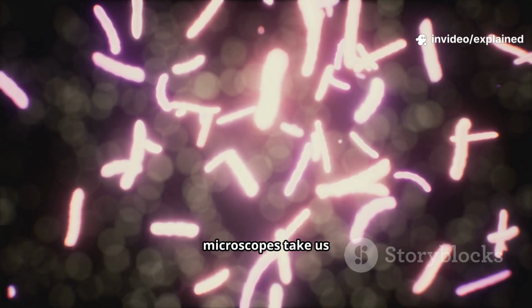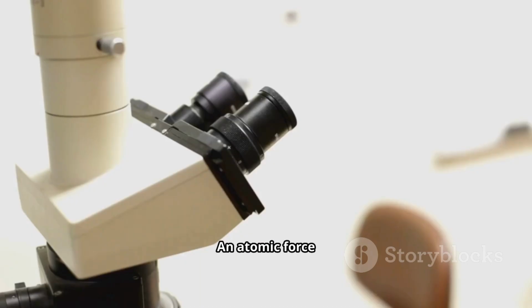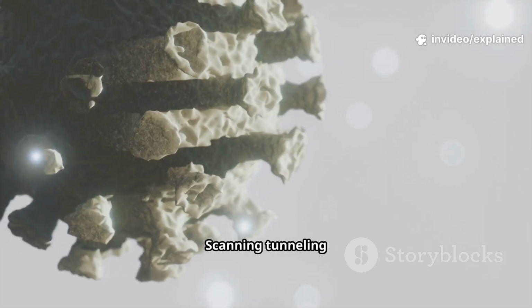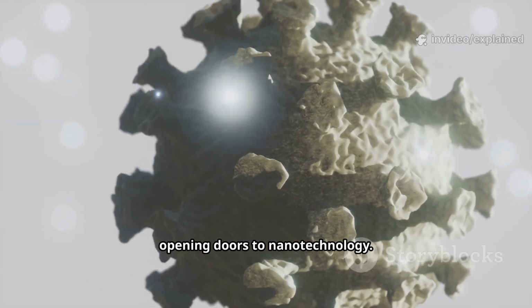Scanning probe microscopes take us even further, actually feeling surfaces at the atomic level. An atomic force microscope uses a tiny probe to map surface topography with atomic precision. Scanning tunneling microscopes can even manipulate individual atoms, opening doors to nanotechnology.